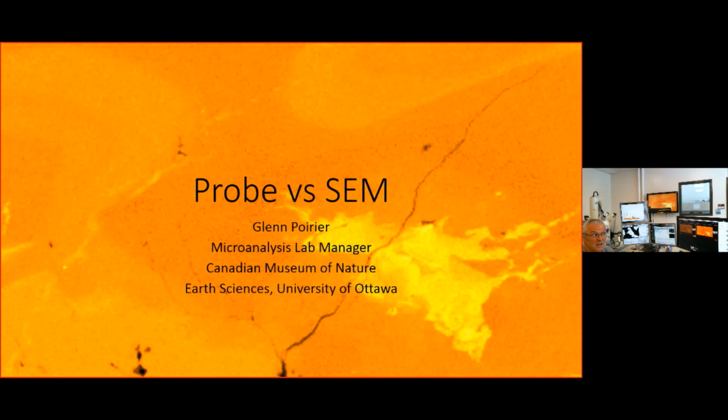Microprobes, I think right now, there are about 7 or 8 in labs across Canada, mostly associated with universities. It can be very tricky to get access to the machines if you're not associated with a museum or something like that. So I want to talk to you about what they do, why they're different, and what they can do for us as mineralogists and mineral collectors. And so let's get started.